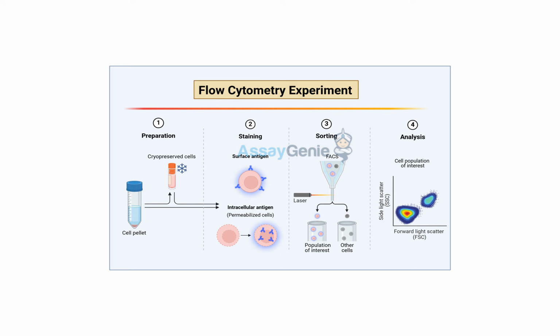So there are a couple of methods that the article talks about. The first one uses this gentle agent called Saponin, and it basically creates these tiny pores in the cell membrane. So almost like poking tiny holes. Just enough for the antibodies to slip through. So it's like we're carefully opening a tiny door just to let those antibodies in. Just enough. And what's great is it's reversible. So the cell can actually repair those pores after the antibodies have done their work.